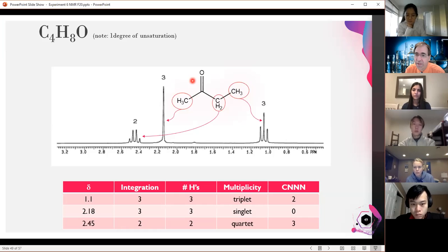There is a shorthand notation that if you read the literature would say something like delta 2.45, 2H, quartet, actually Q. And it's a shorthand notation for journals, so you don't need this whole thing. But using the shorthand notation implies that you can take that and reconstruct the NMR in your head. We're not there. So we're going to use this version of annotating as opposed to the literature one, because the literature one is kind of, it's deep inside chemistry.